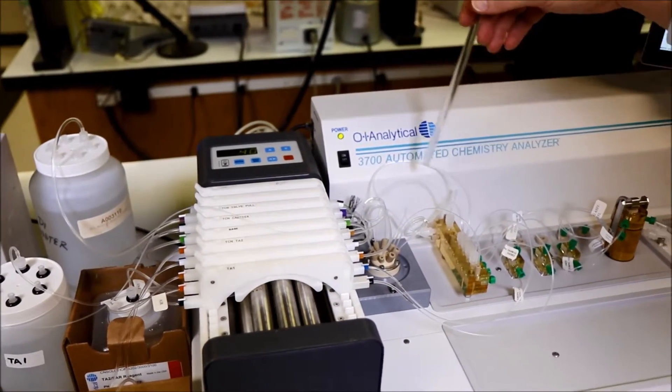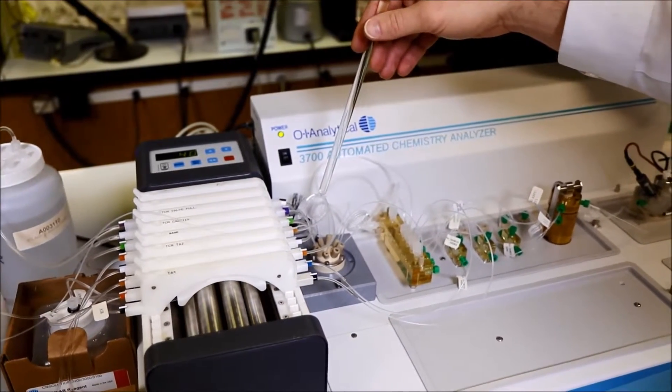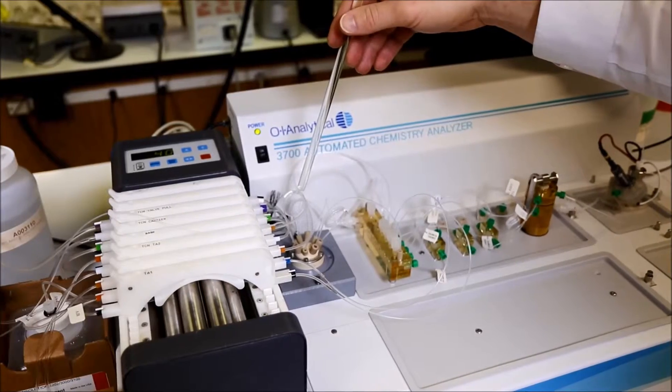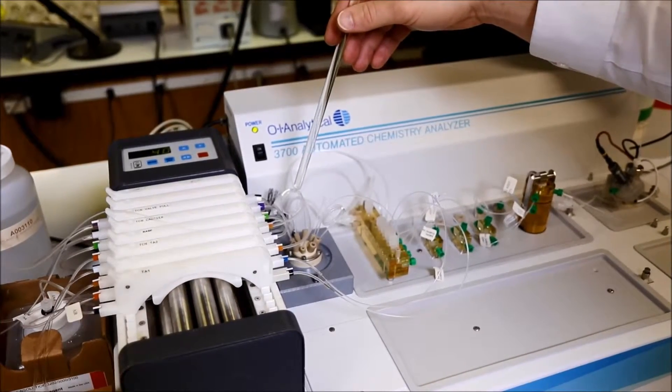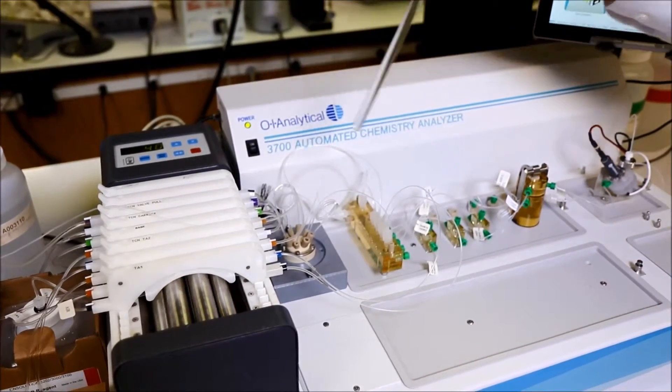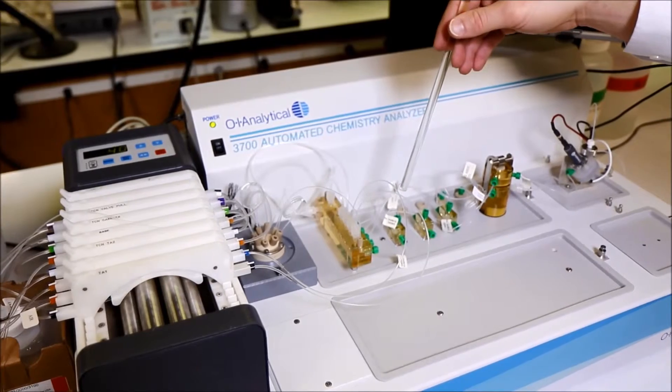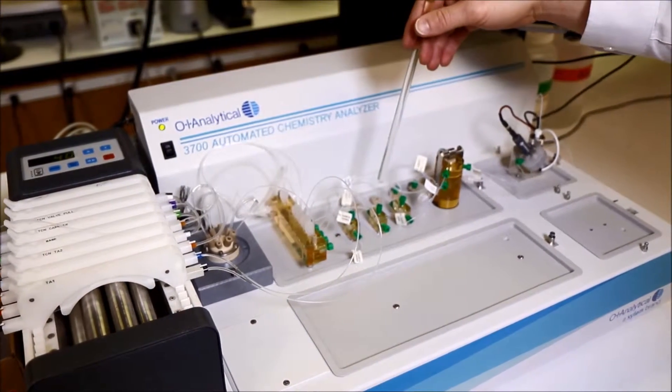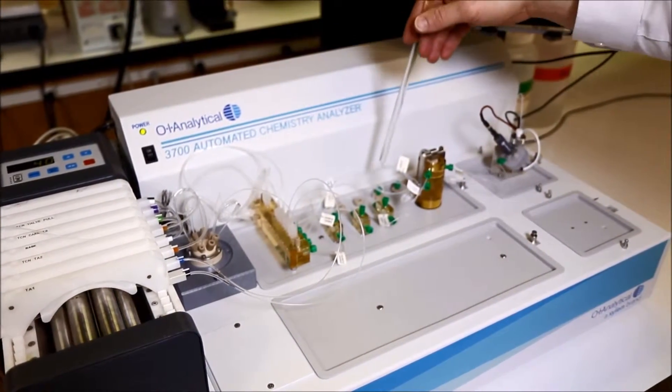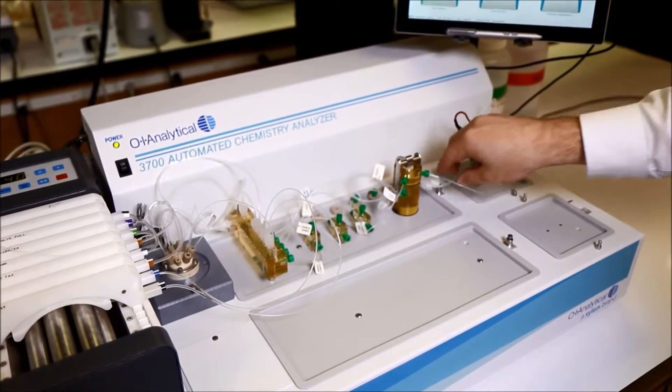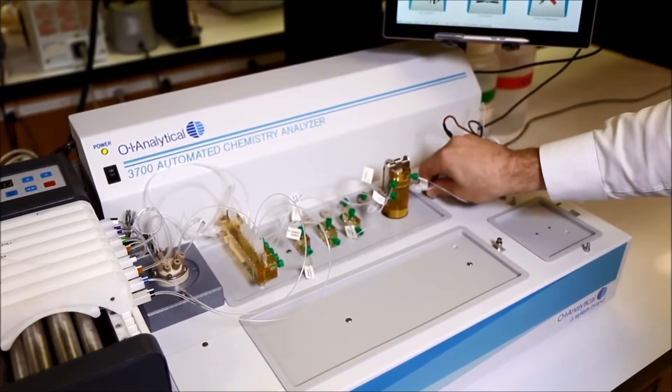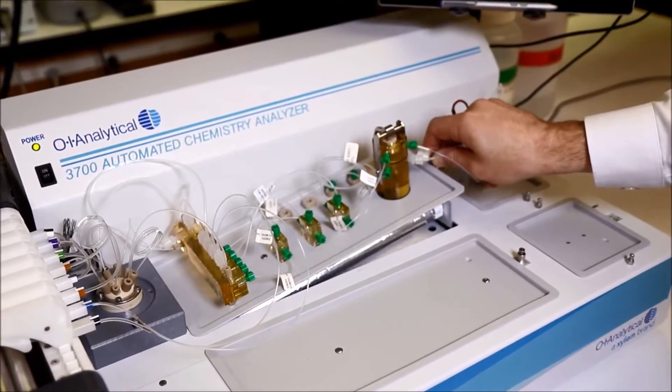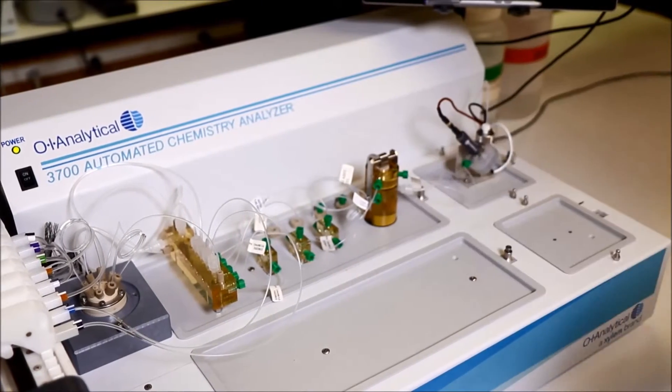The sample fills the injection loop and when the FIA valve actuates, the sample is combined with TA1, air-segmented, and then sent down to the UV digestion coil located on the lower side of the analytical cartridge.